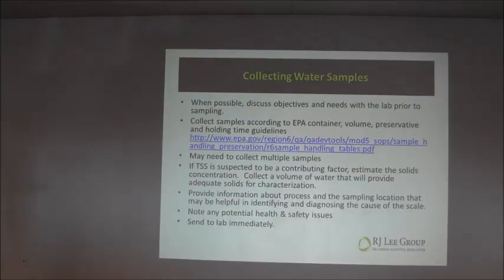Most labs, if you can give them a little bit of notice, can send you some sample containers, maybe some that are preserved with the appropriate acids, so that as you get into the interpretation, there's no questions about what might have affected the data and what might not have.